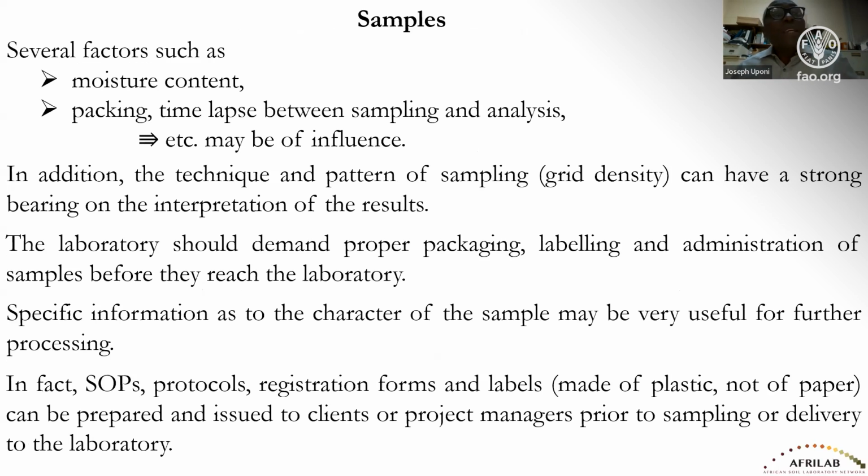Another critical factor is the way the samples are handled. You know that such factors as moisture content, the time lapse between sampling and analysis can affect the results that you analyze. Typically, for instance, if you want to analyze nitrate in soil, usually you want to do the analysis on fresh samples. And when those samples are collected, they're supposed to be refrigerated to be sure that there's no degeneration in the samples. Otherwise, what you are measuring is not really related to what is actually in the field. That is for that type of measurement. But for most of our routine measurements, we use air dry samples. So that may not apply for those ones.